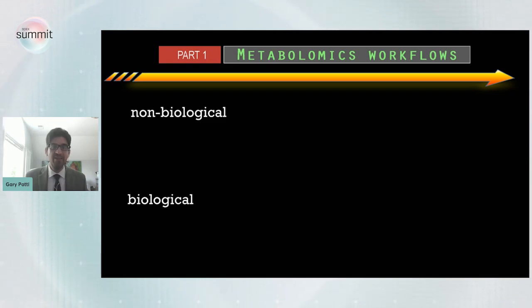And as I say, this isn't just work that we've done, but this is work that builds on the research from labs all over the world. So the first thing we want to do is recognize that the signals that you measure can either be of biological origin or they can be of non-biological origin.